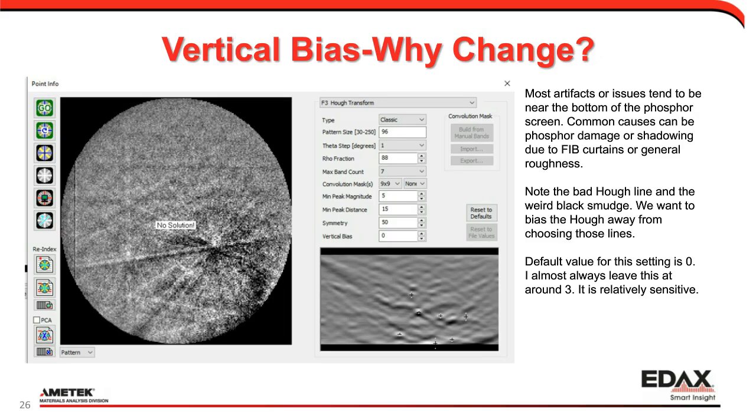Again, really kind of a good question. And again, I think it's kind of a known problem with some micas that what bands you get, I think, is controlled a lot by what element you have where in the crystal structure, because that kind of controls what reflectors we see.